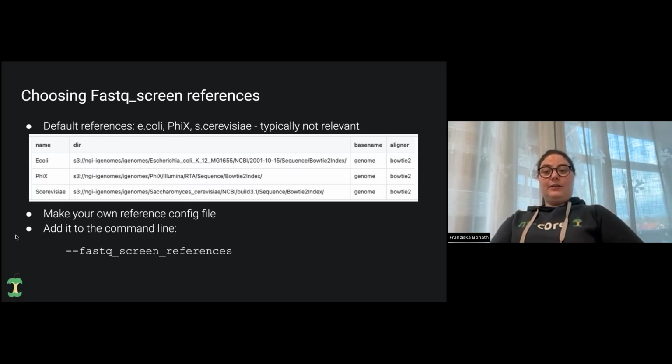And that should then also map it to the species that you're actually interested in. We kind of did this on purpose, because every group and every core facility will be interested in a different set of those. They may have a specific likelihood or higher likelihood of a specific contaminant.